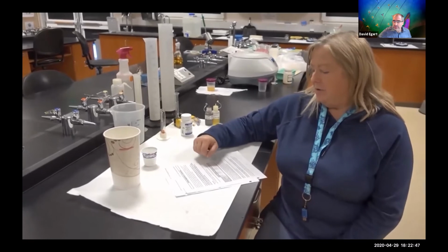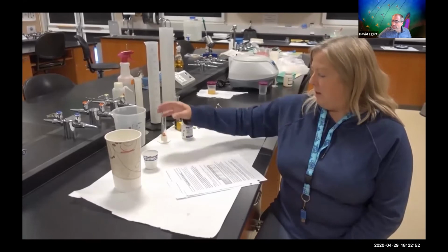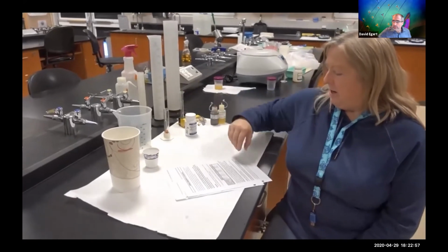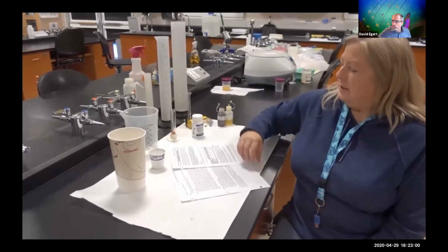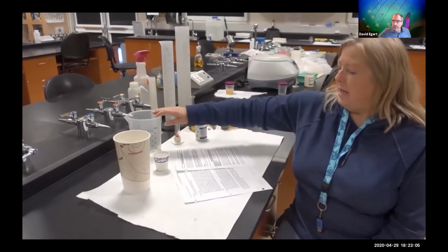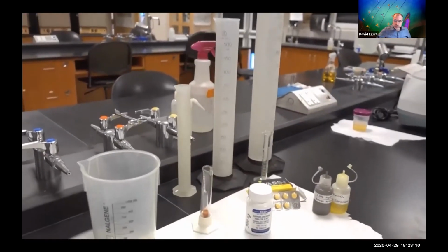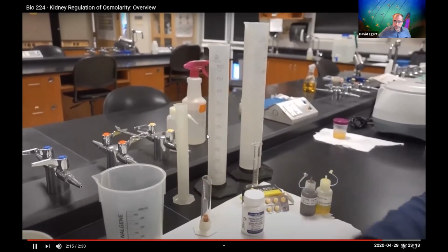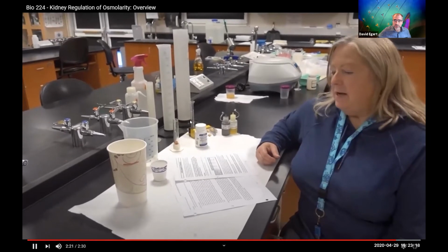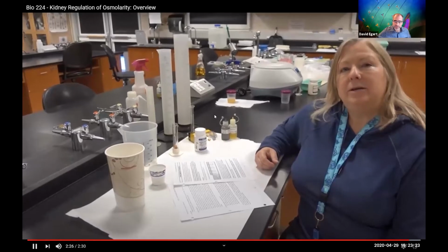After 30 minutes, students will empty their bladder in various containers using the restroom. Then they are going to do various analyses on their samples. They're going to measure their volume, and we have different sizes of graduated cylinders to hopefully match closely the overall volume of urine that was collected every 30 minutes. Specific gravity, we'll show that in just a second, and also sodium chloride concentration, we'll show that next.